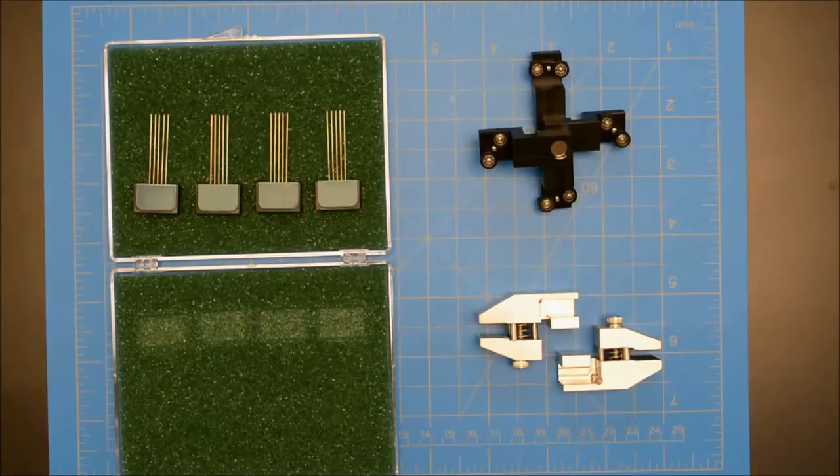We have been very happy with the Biotester from Cellscale, as it allows us to test tissue samples very efficiently. We use a variety of fixtures and load cells to accommodate various tissue samples.